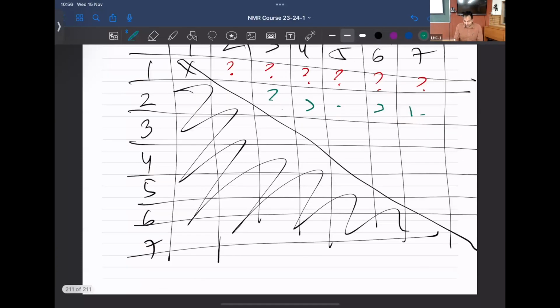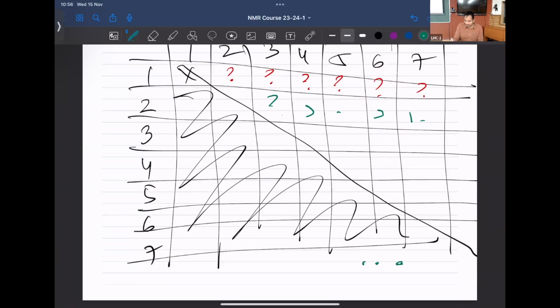For instance, if you're having something like this and I'm sitting here, when you end up recreating, you might end up recreating something which is symmetric and opposite also. Okay, but of course, this is not an obvious example. There are other examples where degeneracies would come. So as many distances as you collect, you'll be able to define the structure better. True? That's essentially what a NOESY does.